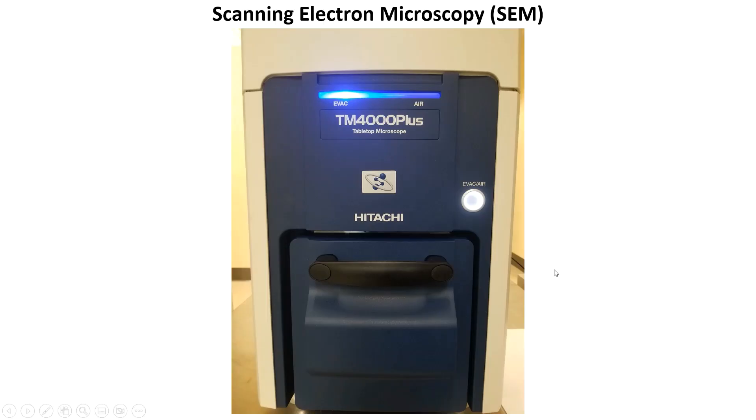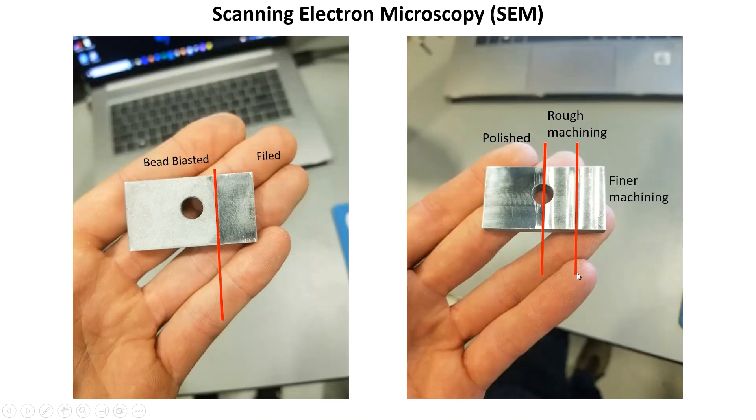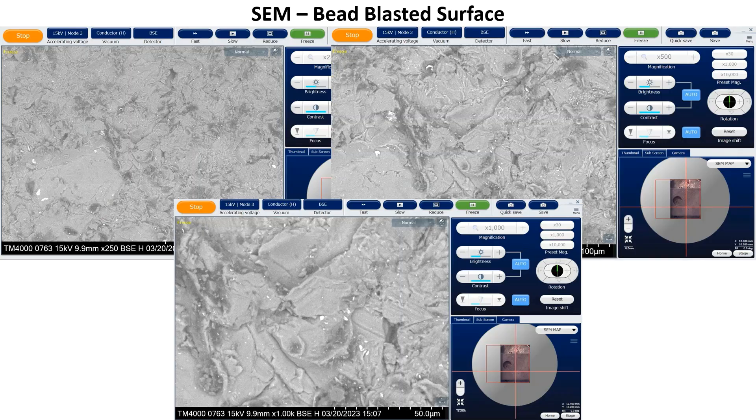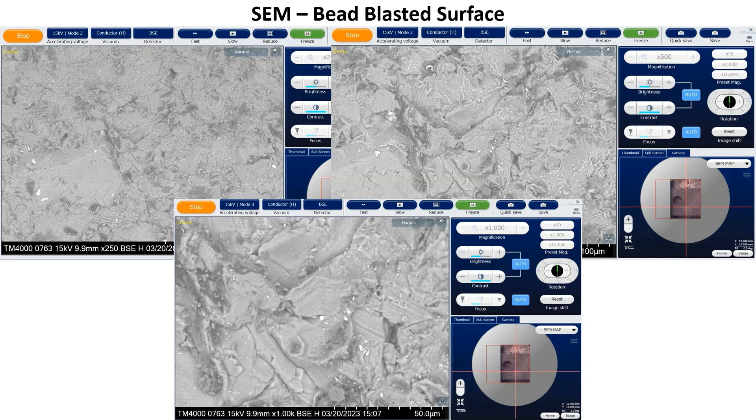This is the scanning electron microscope that I have access to in the shared tooling space at my work. It is a little desktop unit that is quite capable for its size and price. I wanted to see the effects of surface finish on the final anodized part and also wanted to see if I could capture an image of the porous columnar grain structure of the aluminum oxide that I had formed. I prepped my part in the ways shown and imaged all the different surface finishes at the same magnification level for a comparison before I began the anodizing process.